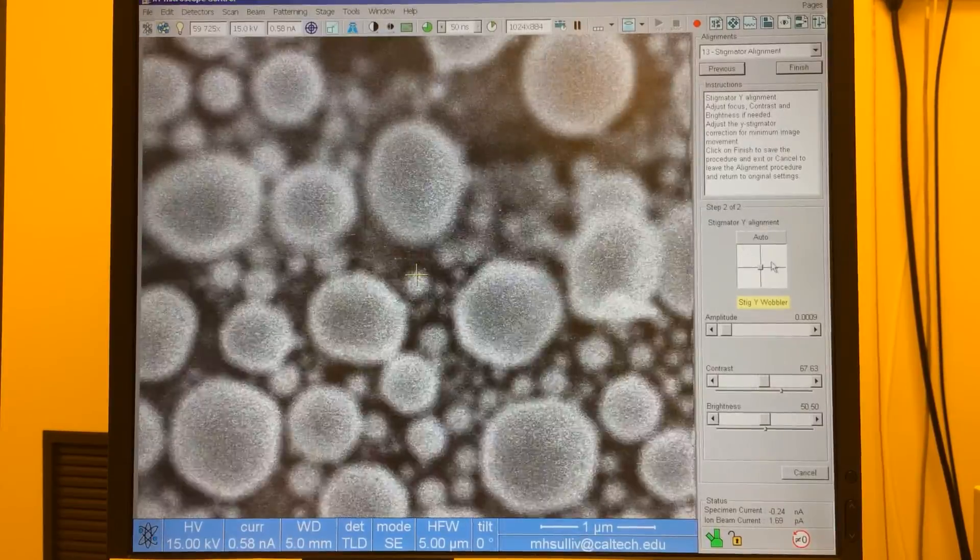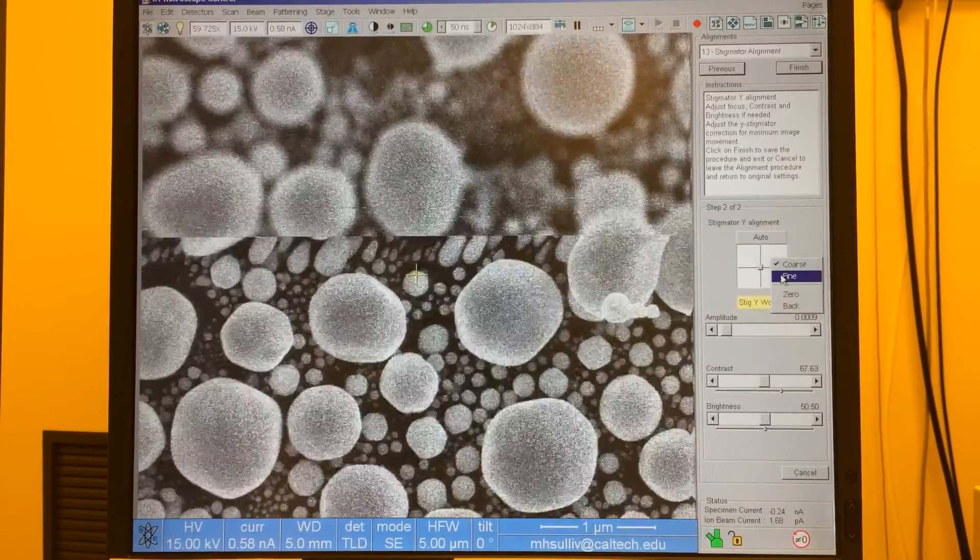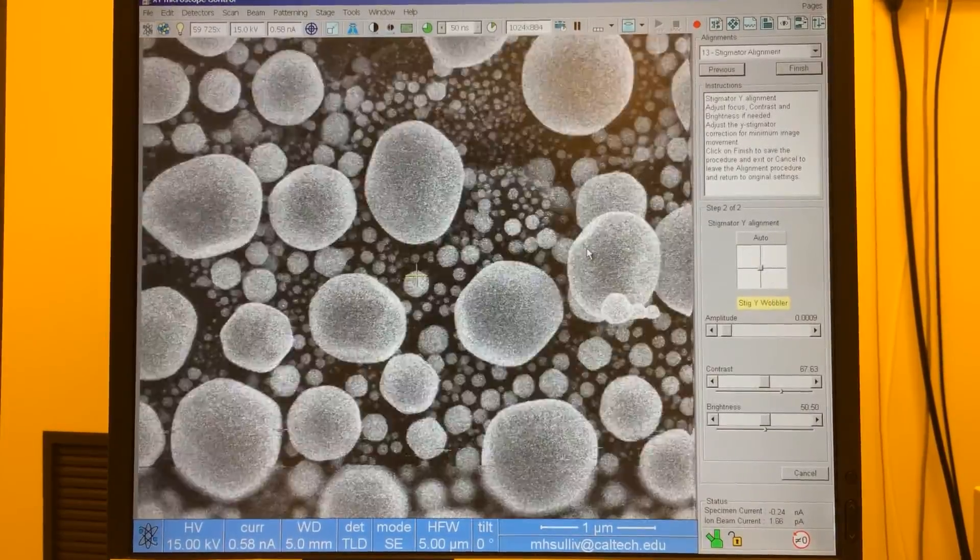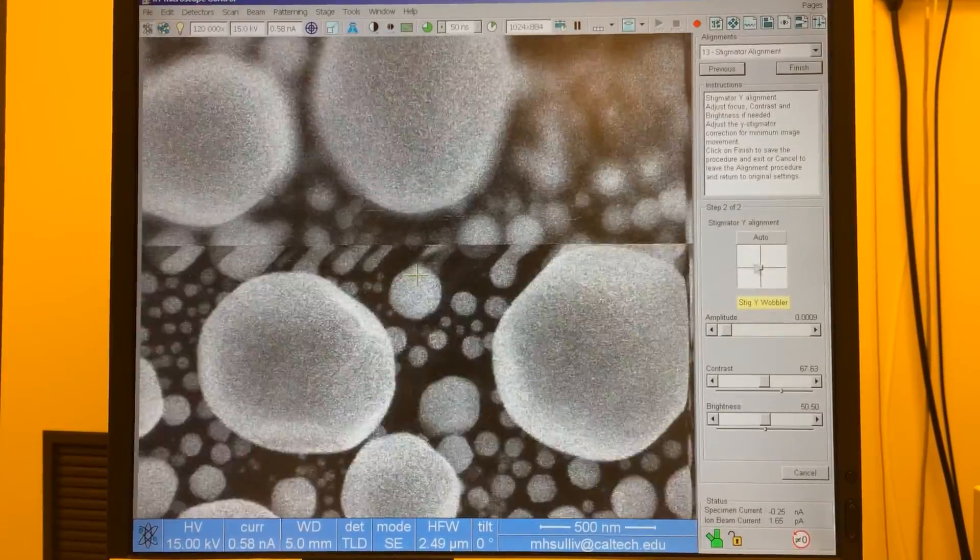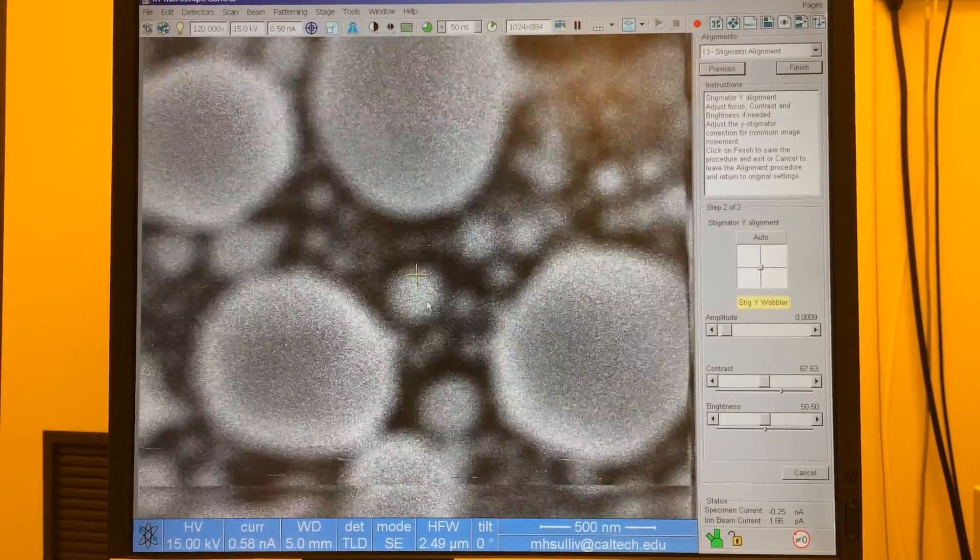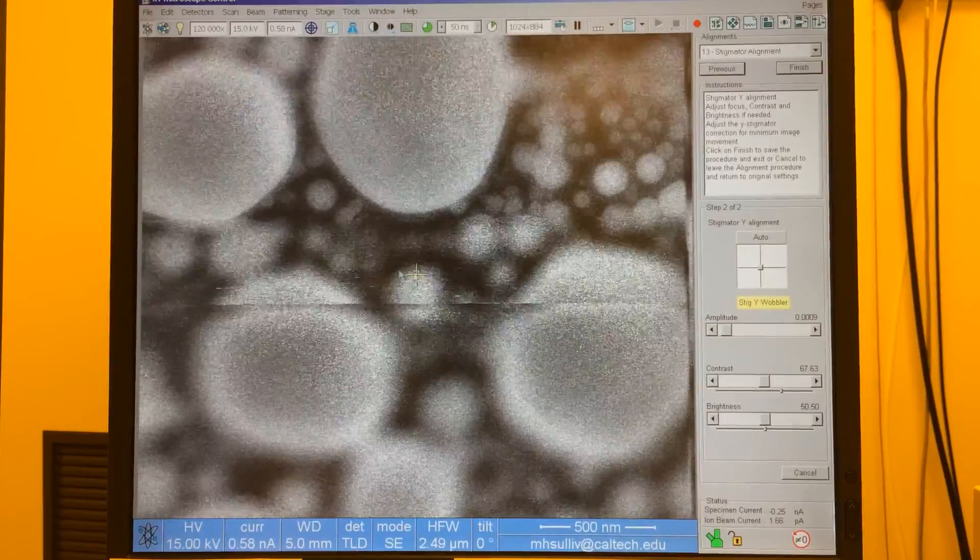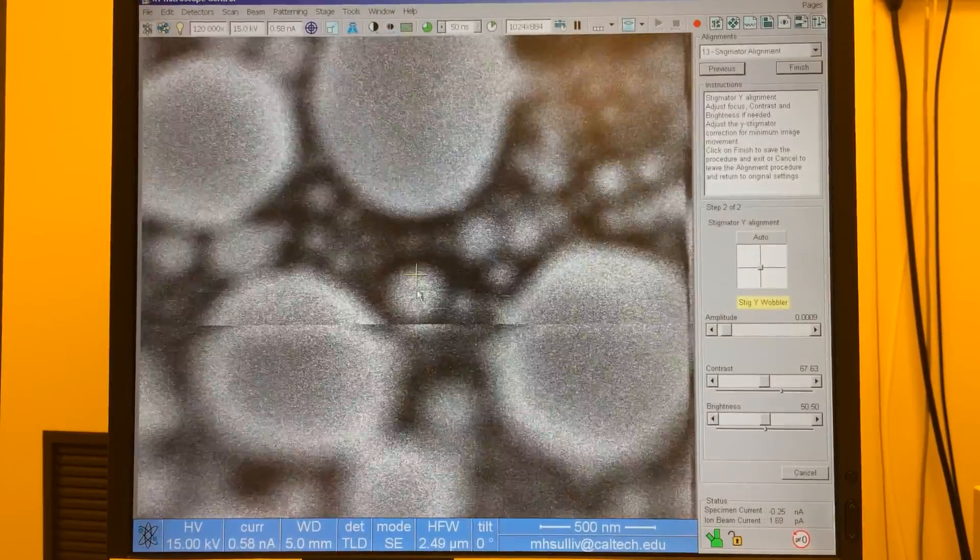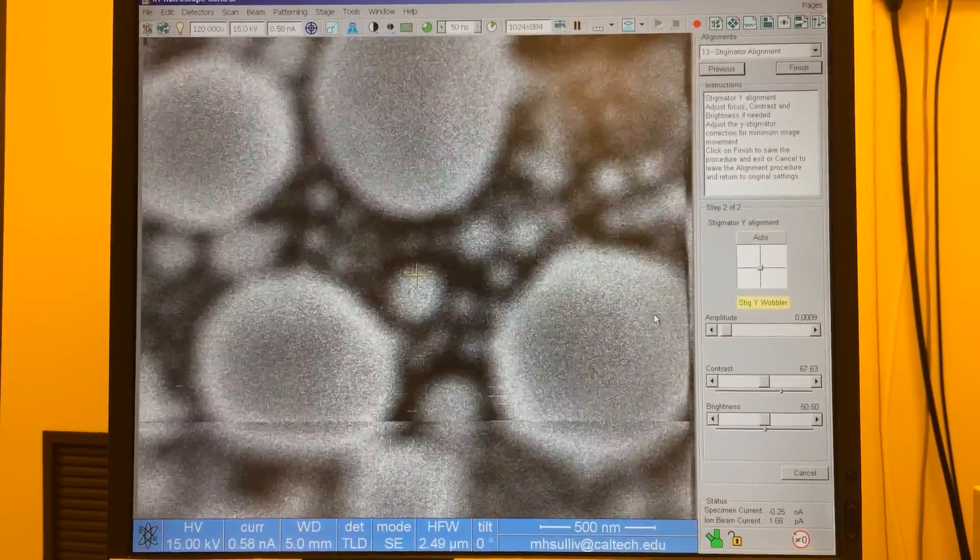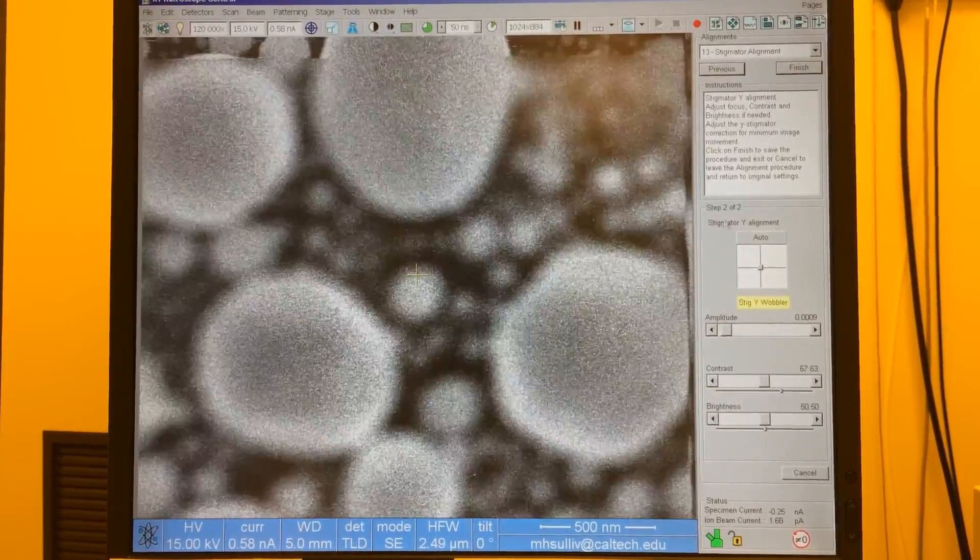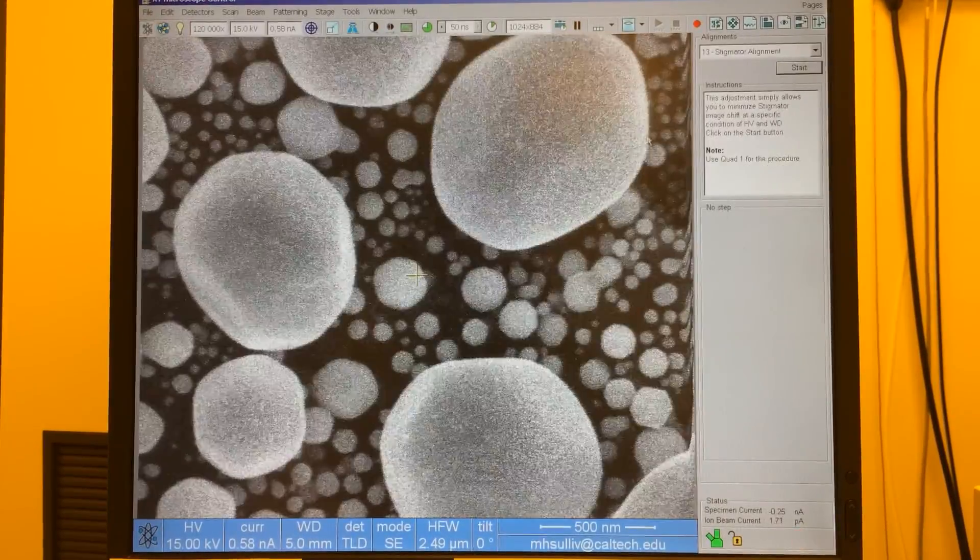Now you can also right click and go into fine mode. You can do this at higher magnification and you can try to really fine tune this. In my experience I find that if it's blinking or shifting only a little bit like we see here, that's about as good as you're going to get it. So in that case you'll be finished.